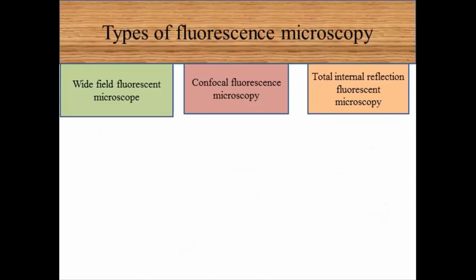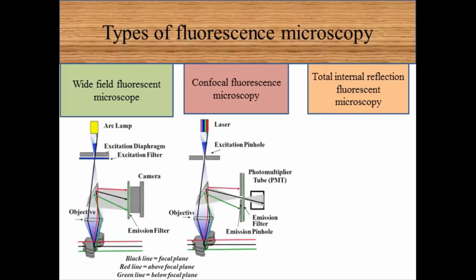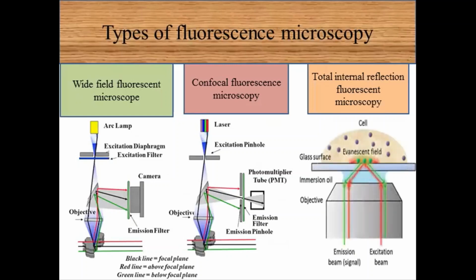Here are the types of fluorescence microscopy: wide field fluorescence microscope, confocal fluorescence microscope, and total internal reflection fluorescence microscopy.